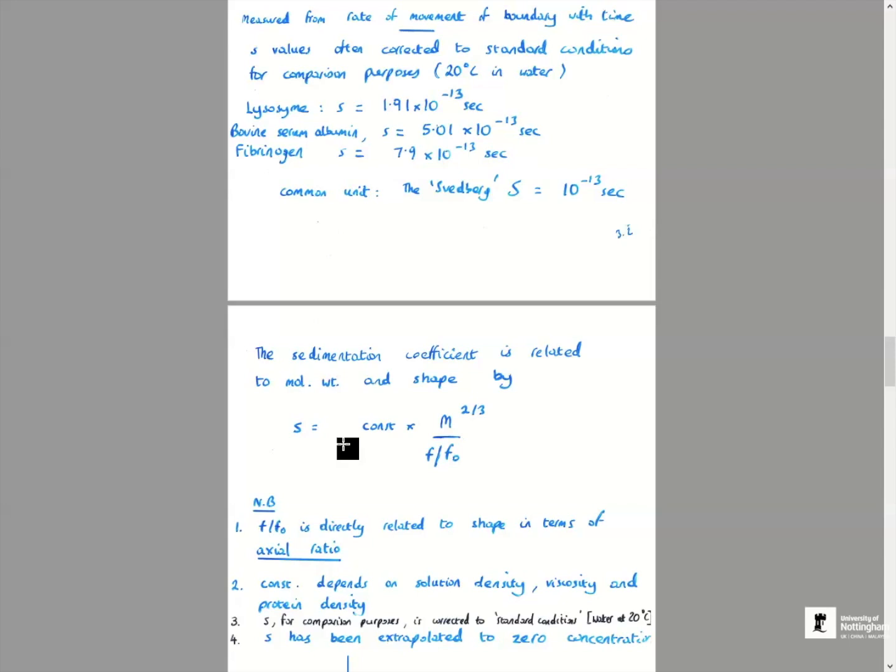It's the friction coefficient of the macromolecule divided by the friction coefficient of a sphere of the same mass and anhydrous volume.